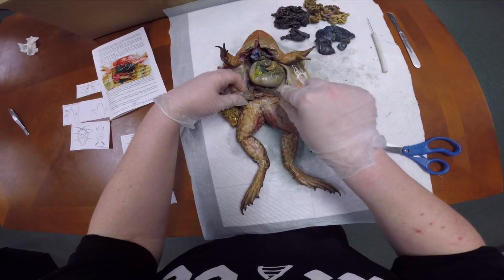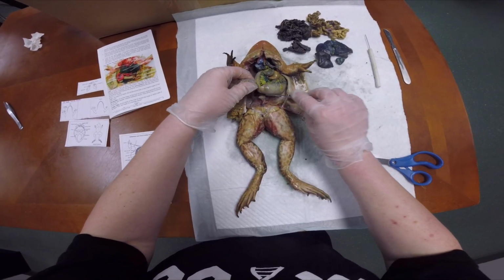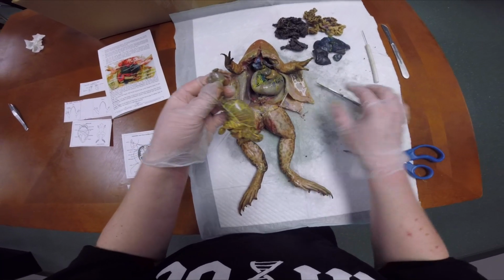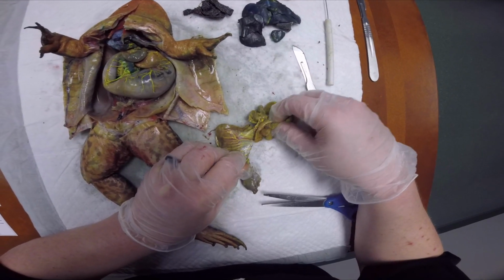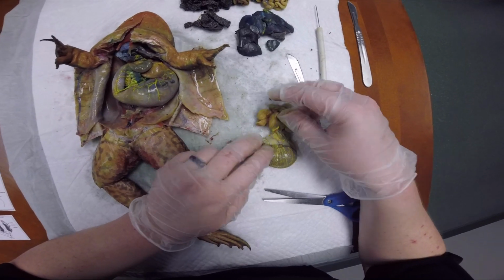This one goes down into the cloaca area where he would poop and pee from. Okay, so this is the large intestine, and it looks like they dyed this one too because there's yellow and you can see the veins from there because of that dye.